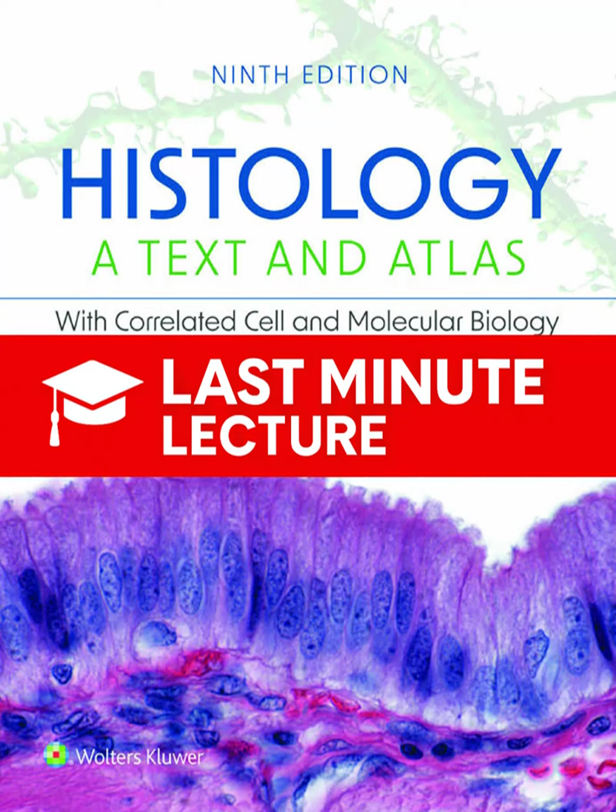And that labor is why the newer automated methods built into the SEM are so important, like Serial Block-Face SEM. SBF-SEM is a major advance. It puts a precise ultramicrotome right inside the SEM vacuum chamber. The whole cycle is automated. The microtome shaves off a super thin slice, say 20 nanometers, and immediately the electron beam images the newly exposed block face before the next cut.